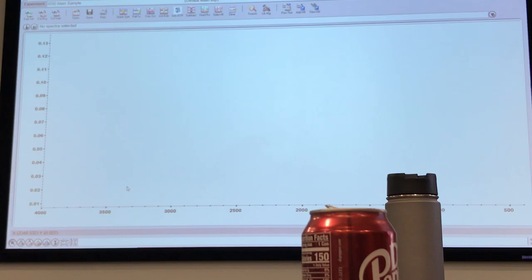Okay, so we talked about subtracting it out, looking at it in depth, and seeing what this contaminant is. A suggestion came up: can we just create this as a routine? Can the software do this for you automatically? Yes, it can, more or less automatically, if you have the individual components stored in your library. You can have phthalates stored, you can have your PET stored, you can have all the individual components or contaminants that can show up stored in a library. Then we have the software called Spectra that will help you look at components.